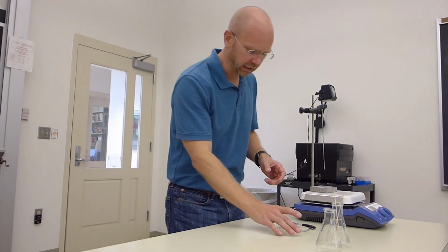So the first thing you would want to check is that at room temperature it's not super soluble. And then you would want to see what happens if you warm it up. And if it goes into solution, ooh, that's a good candidate solvent, right? And oftentimes at the beginning of a recrystallization, that's exactly what you do.